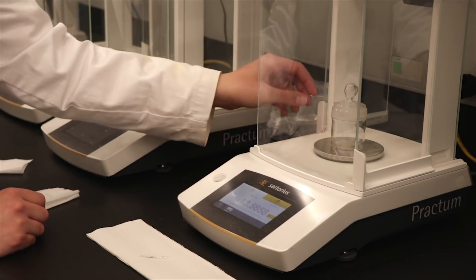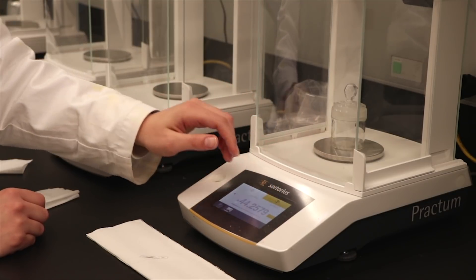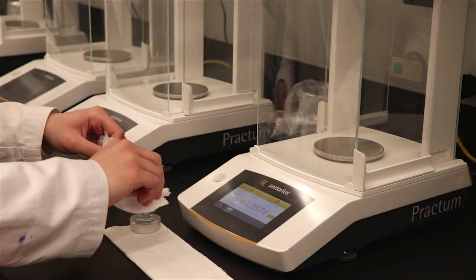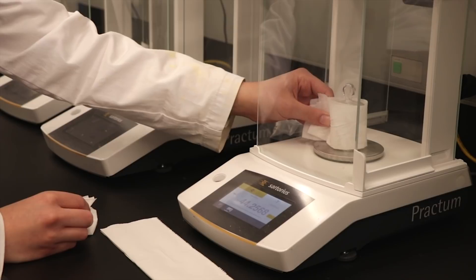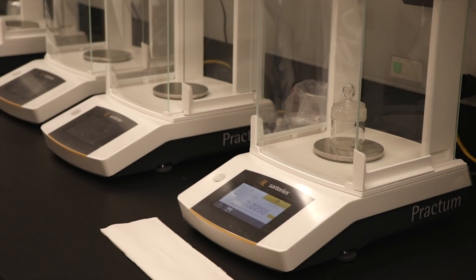Accurately weigh the ribbon using an analytical balance. Zero the balance with the weighing bottle. Then add the ribbon to the bottle and record the mass to four decimal places. Ensure that the doors of the balance are closed before each reading. Once the ribbon is weighed, do not touch it with your bare hands.